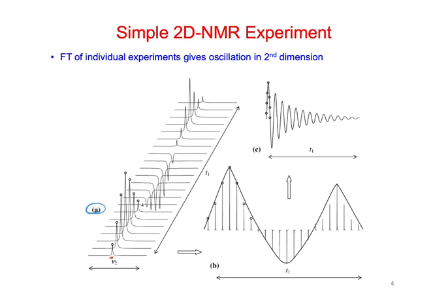But this one in B down here is showing that we're actually measuring these discrete points. And that's what the curve is from these points. Okay? So what does this look like if we have this relaxation? What does this figure here start to look like? The FID, right? The free induction decay. And this is what we got, that we did the Fourier transform to get each of these, right?